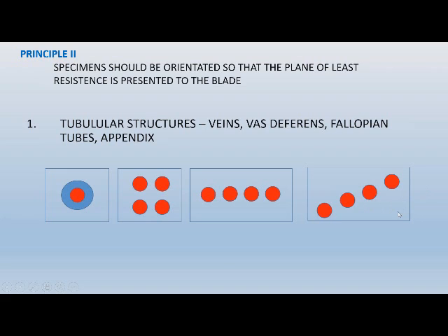So this orientation actually provides the cutter with the plane of least resistance, because the paraffin itself shouldn't cause that much resistance. It's when the tissue comes into play that we get that. So that might be a recommendation of how you'd want to embed multiple sections.